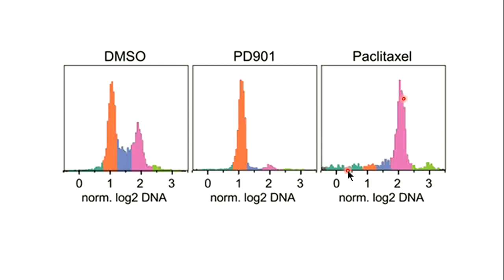Very easy. Till now we have analyzed the presence of protein, then the presence of DNA, the presence of live and dead cells, then how many cells are doing apoptosis, how many are doing necrosis, how many are live, and now how many cells are in G1, how many in S, and how many in G2. Very nice, interesting, time-saving and quantifiable experimentation. Why do I like flow cytometry? Because it can count and calculate everything for you. It gives the numbers, and numbers never lie.